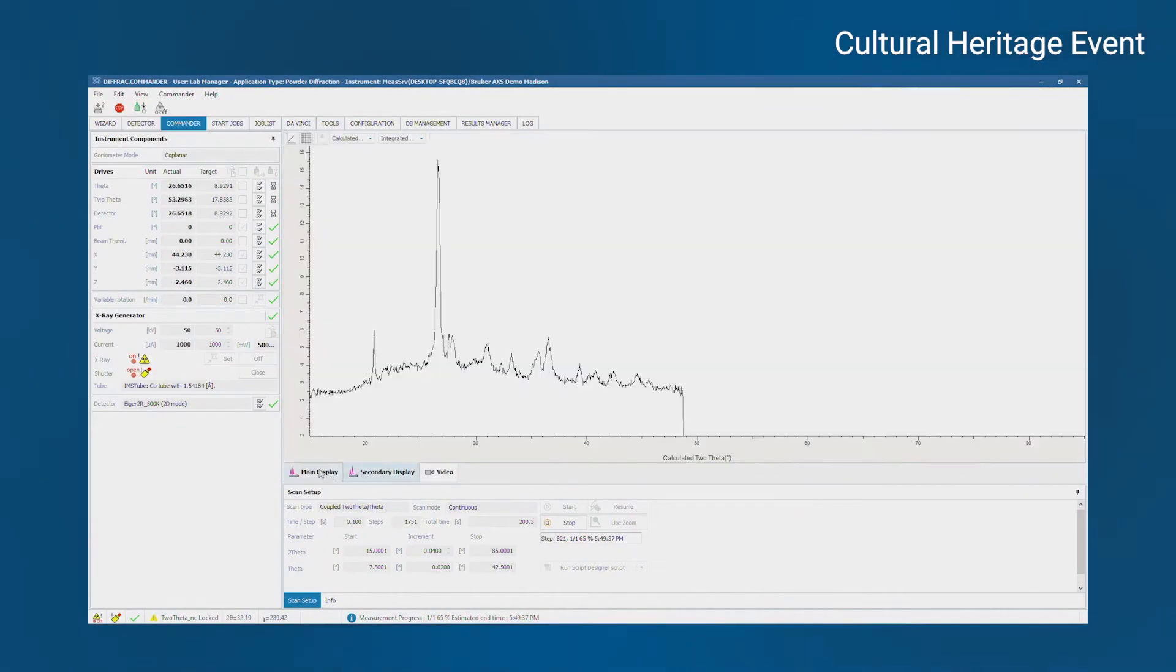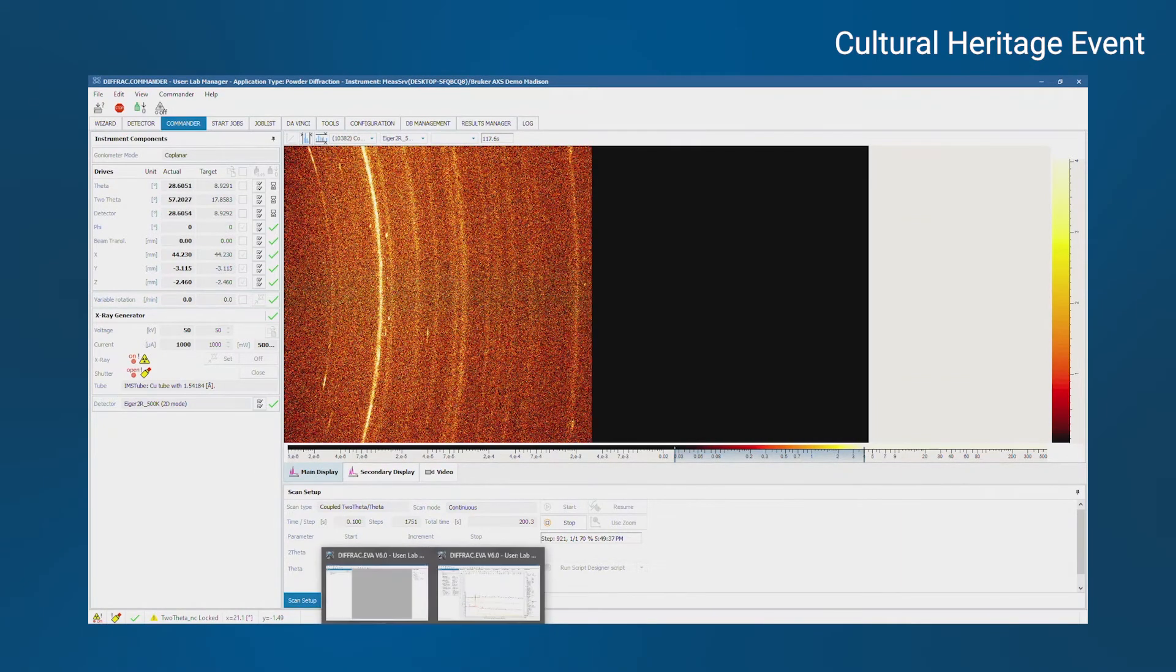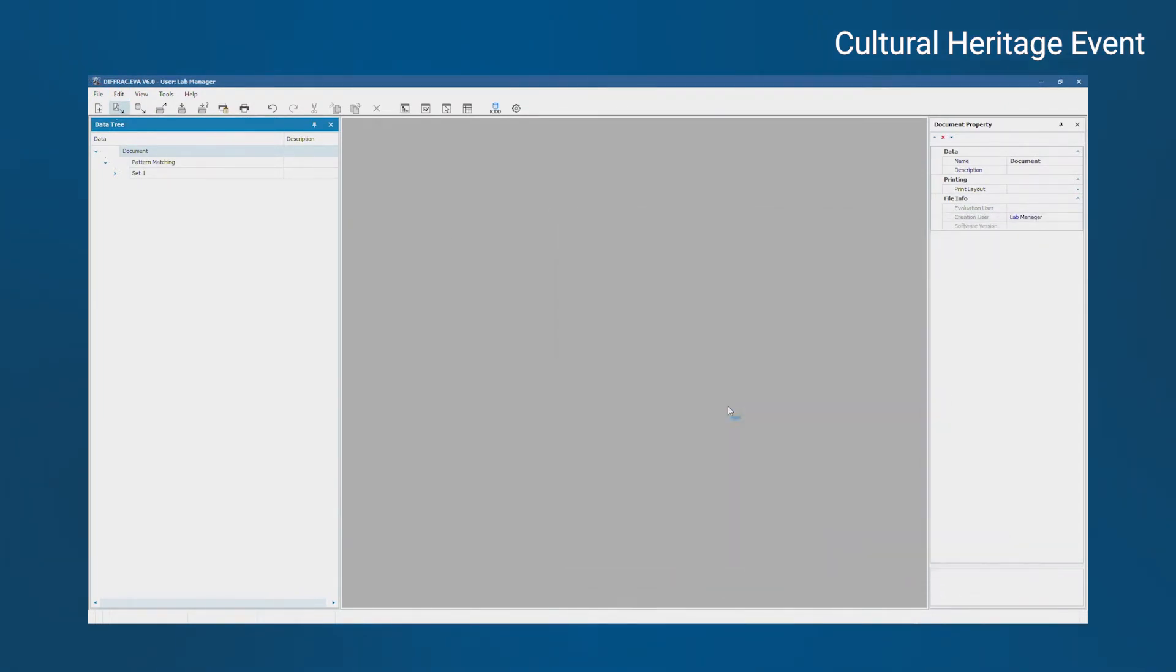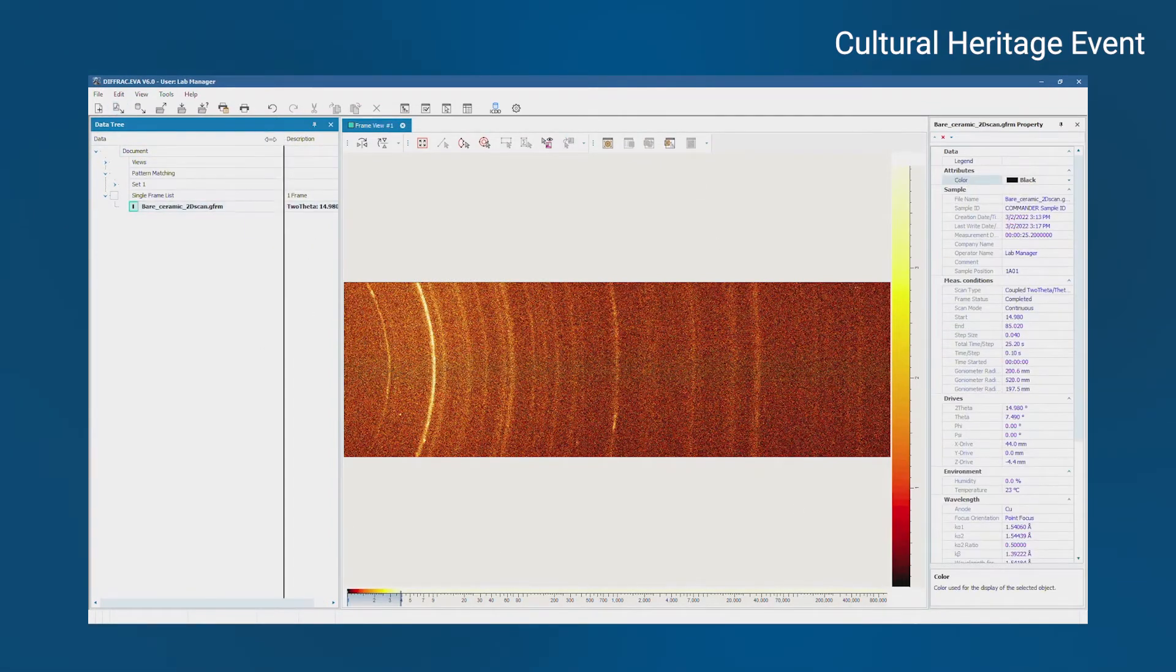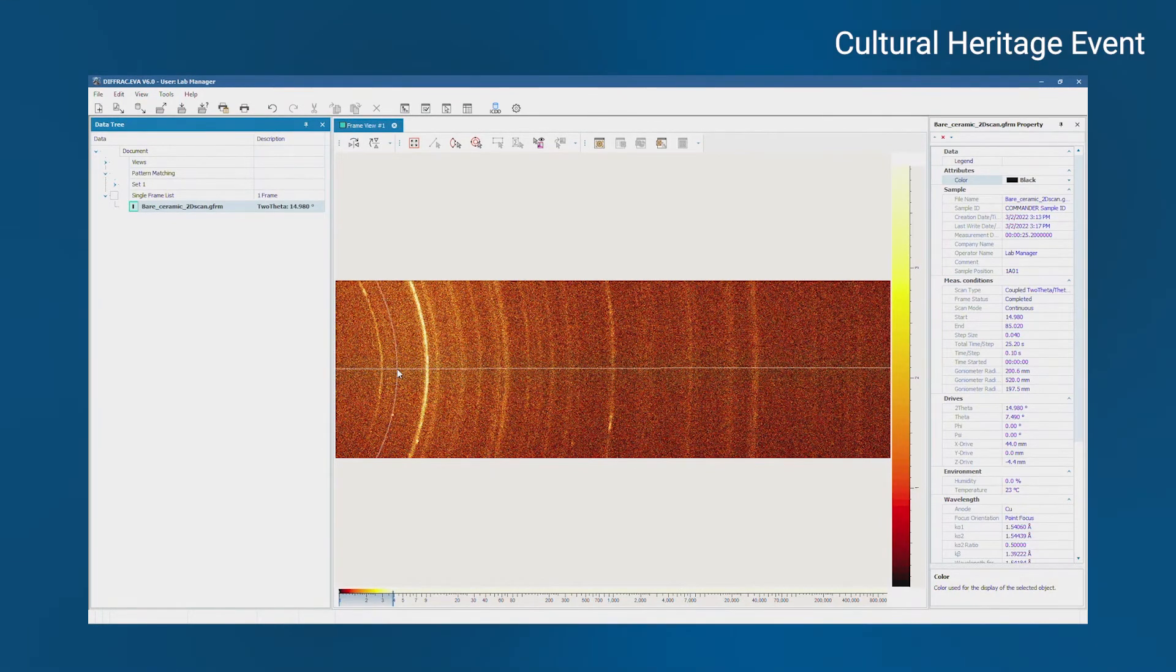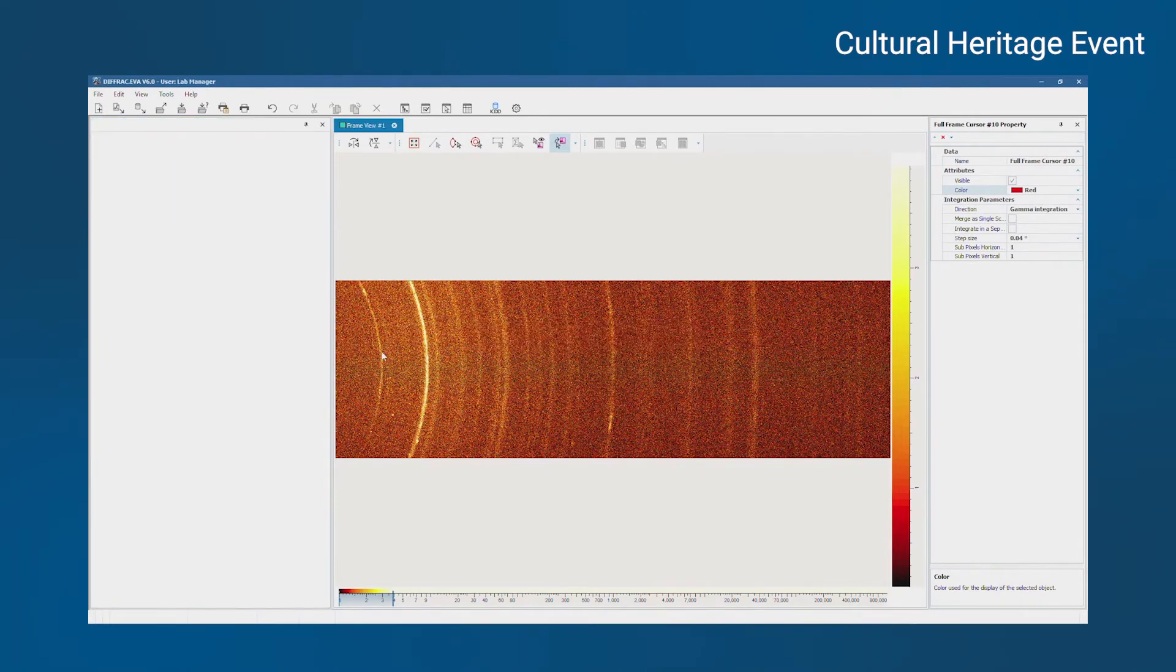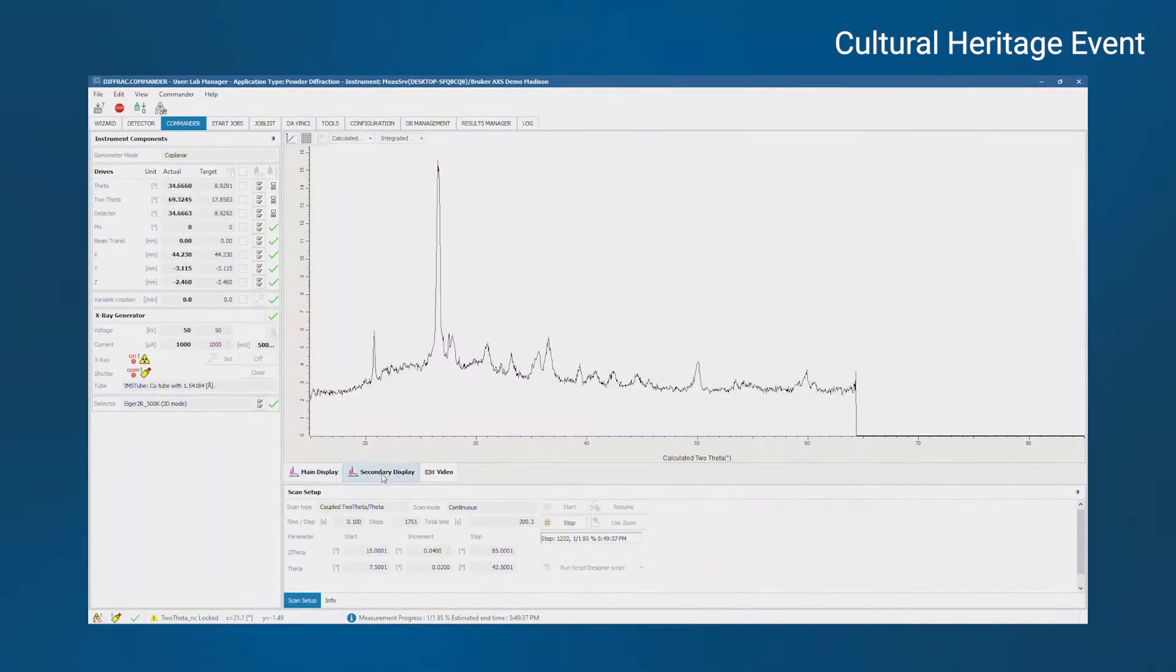On the secondary display, you can see a preview of the integrated data. This is where we'll actually do search match and phase ID. I've actually done this scan already before, so I'm just going to jump over to the scan I took already just to save a little time. This is our evaluation software called diffract.eva. Once the scan completes and you save it, you can just load the frame into EVA and it looks something like this. The first step for analysis of 2D frames is typically to integrate it to 1D. You can create an integration cursor. Integrate. And here's the integrated data.